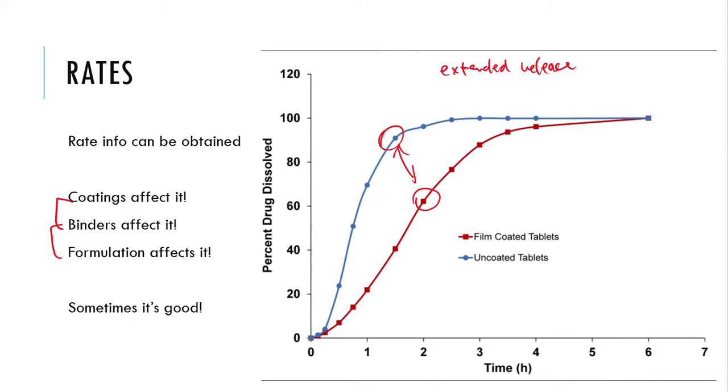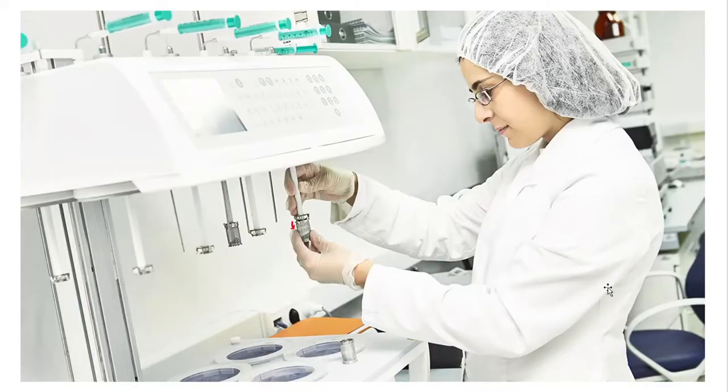All right. Now that's just part B, or part A. So in part A, you will be using a dissolution apparatus just like she is, and you're going to be dropping a pill down into the vat. You're going to be putting a paddle on it. You're going to be setting the right temperature, the right time, and the right rotations per minute, and you're going to allow those things to drop and spin around. And you're going to come back in 60 minutes to see what has happened at that point. So that's as easy as that is. Other than getting the machine started up and ready to run, folks, that's really all that you have to do with this experiment.